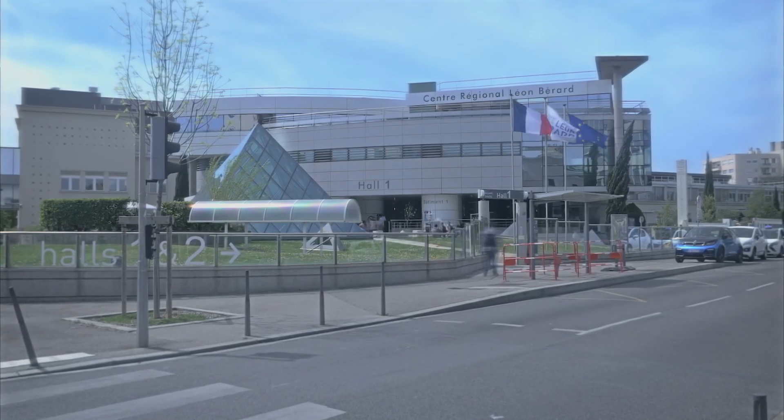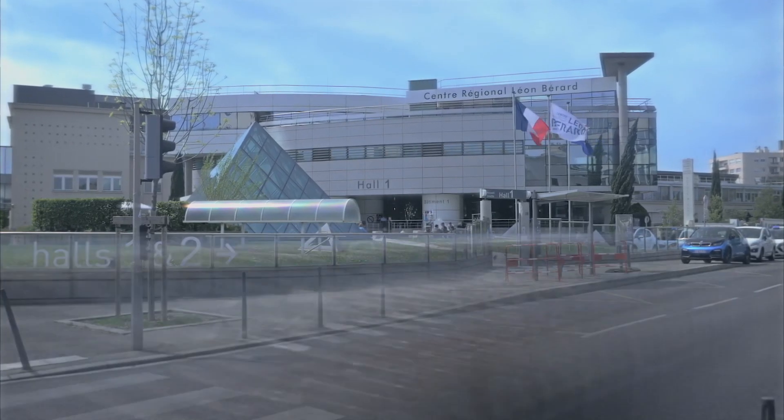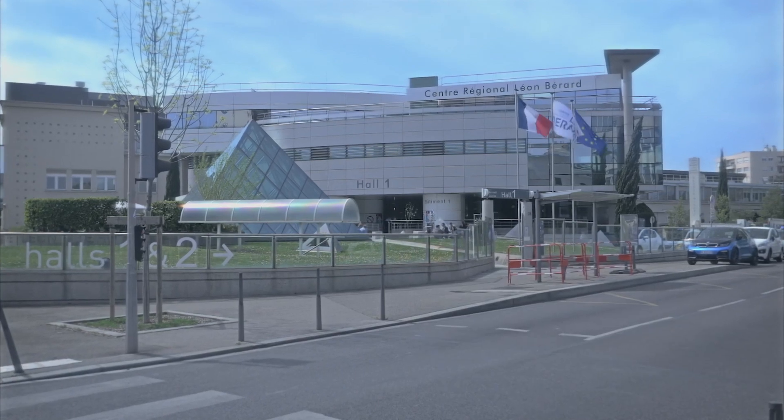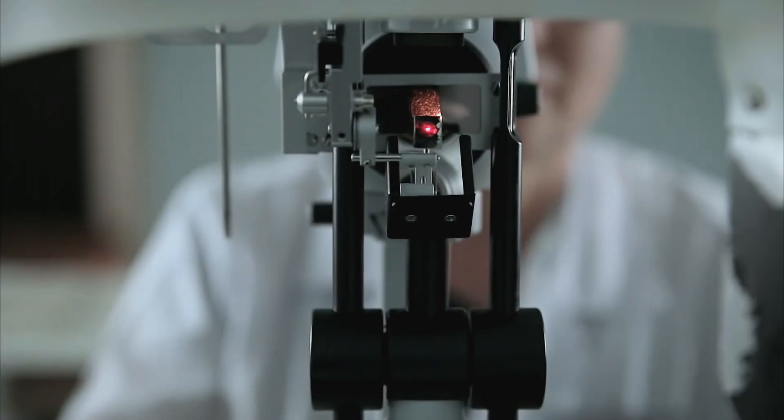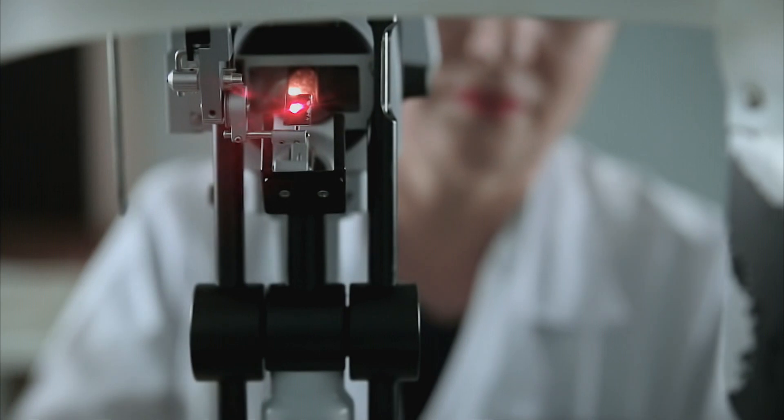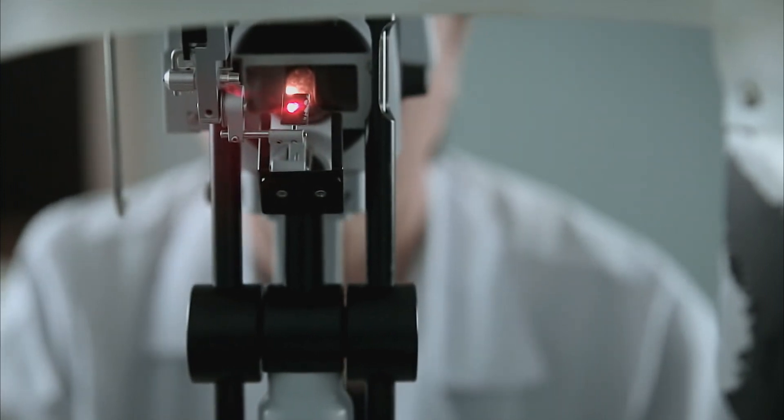Scientists are currently exploring the potential of Brillouin microscopy as a novel non-invasive diagnostic and prognostic tool for degenerative diseases such as cancers, glaucoma, and aneurysms.